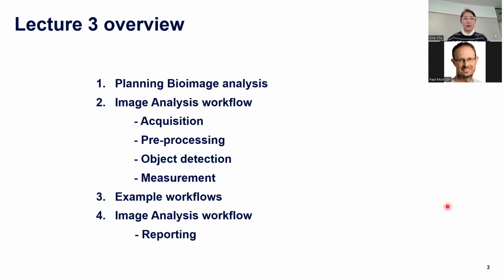In this talk, I will first talk about what needs to be considered in planning bioimage analysis. Then I will go through the basics of 4 steps of image analysis workflows, which are acquisition, preprocessing, object detection, and measurements. Then I will share some example analysis workflows, followed by discussing the last step of the workflow, which is reporting.